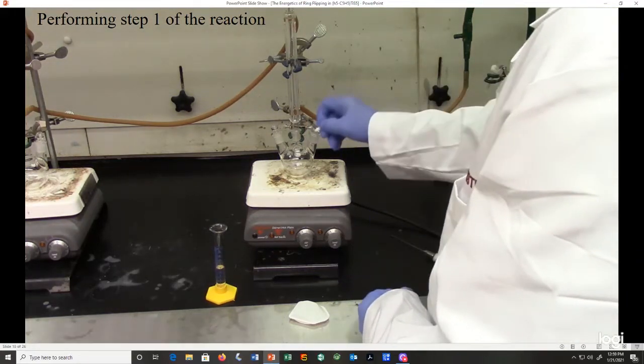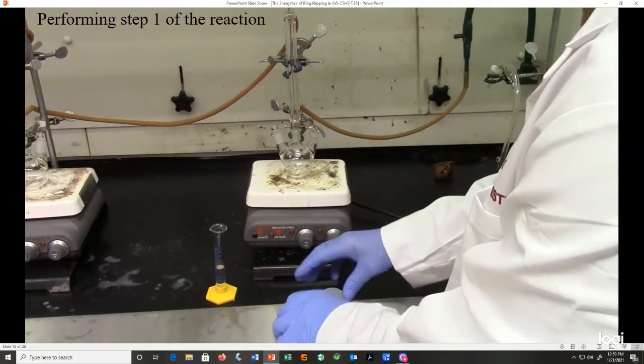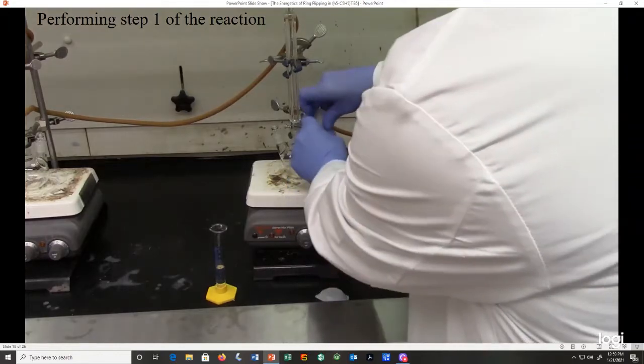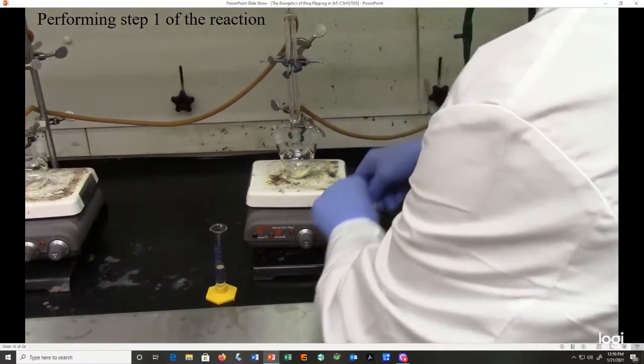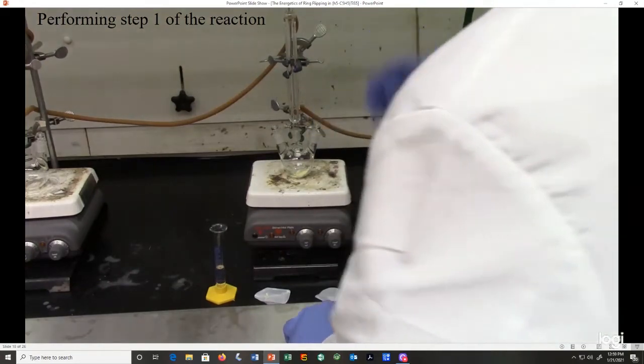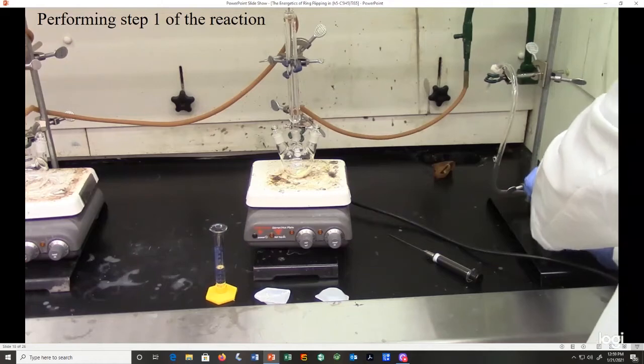First thing that we're going to do is add our stir bar and our sulfur to the reaction flask, and replace the stopper. And so now it's time to get our superhydride solution.